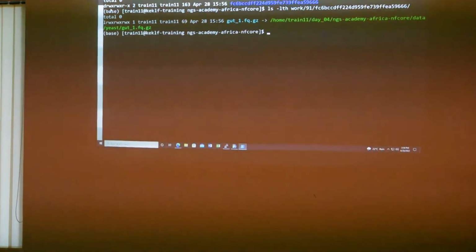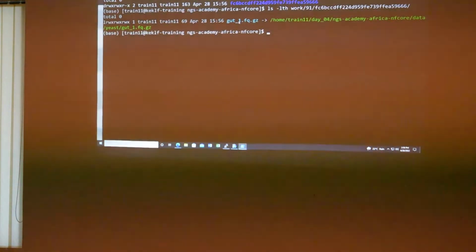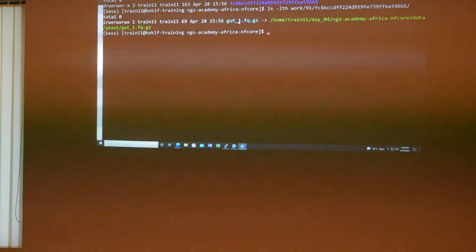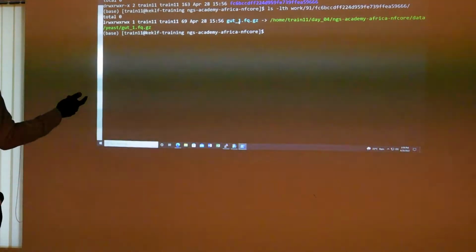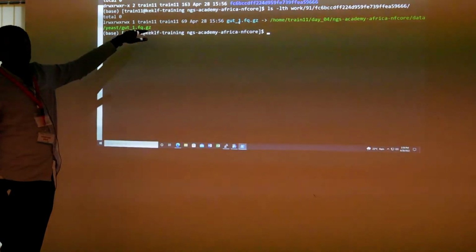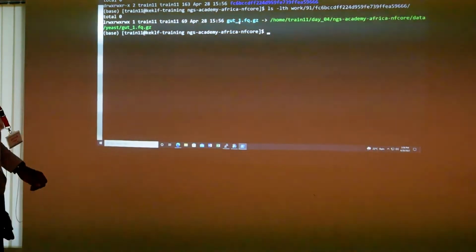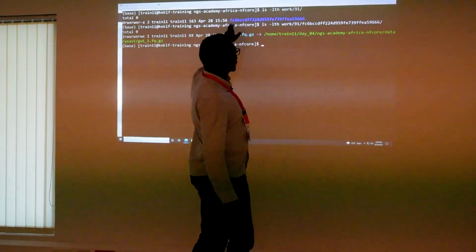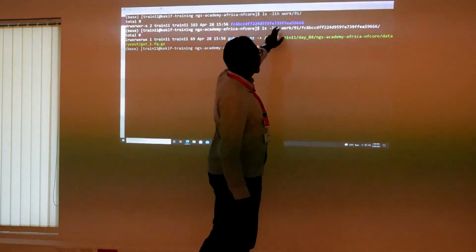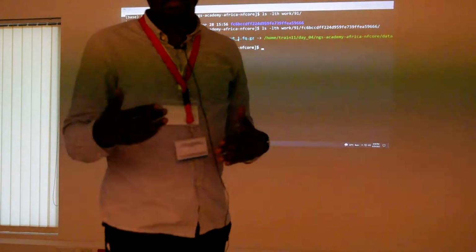So here we see the inputs, so it uses a symbolic or a soft link to show the input, but because we had instructed it to print the output as a standard output, we can't get any file here. So the process outputs are stored in a directory called work, and there are these unique identifiers which enable you to track the processes.